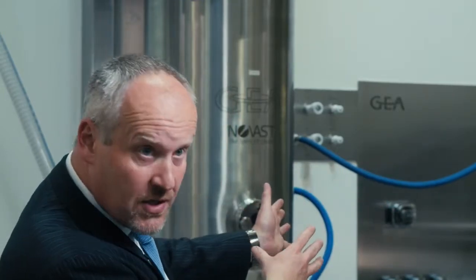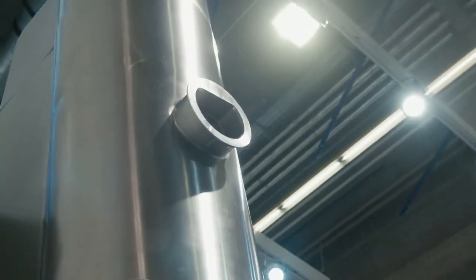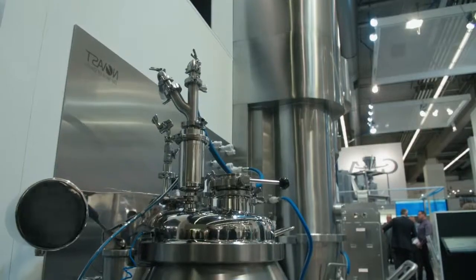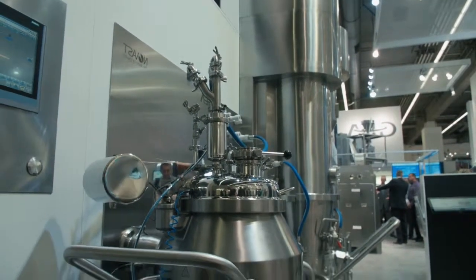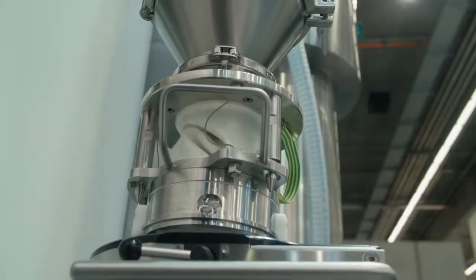The modularity of the PharmaConnect Plus means we can go right the way from 5kg up to 50kg capacity, and that's done by changing the bowl on the machine. The bowl you see at the moment is a 90 litre bowl capable of about 30kg of production. We can go right the way down to a 15 litre bowl or right the way up to a 150 litre bowl. That's paired with what we do on the fluid bed dryer, where we also have a range of bowls that will fit into that system.